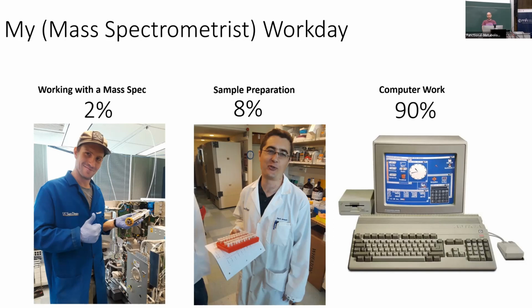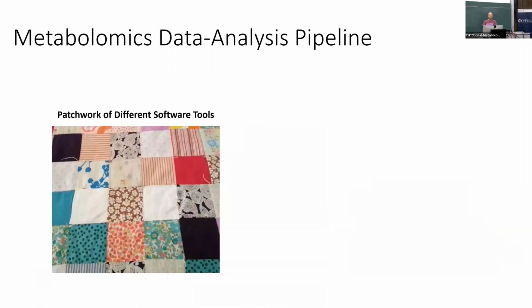Then sampling and sample prep takes some time, but it's also very little in comparison to the computer work we all do. And I think this will be probably the case for many people in omics, or even move more towards the computer side.